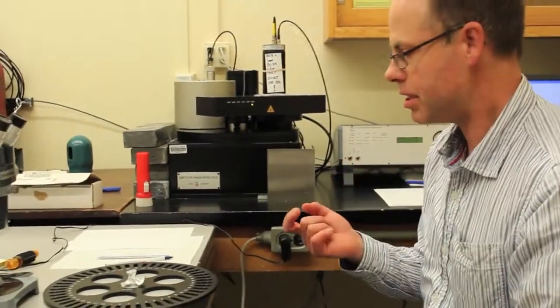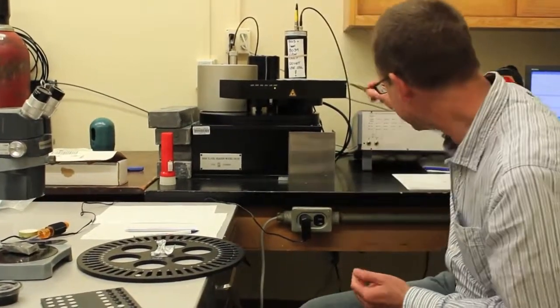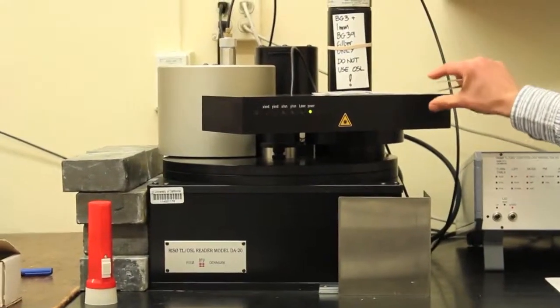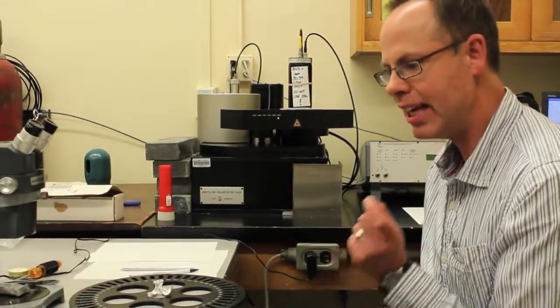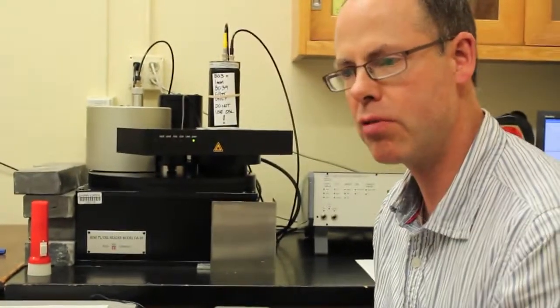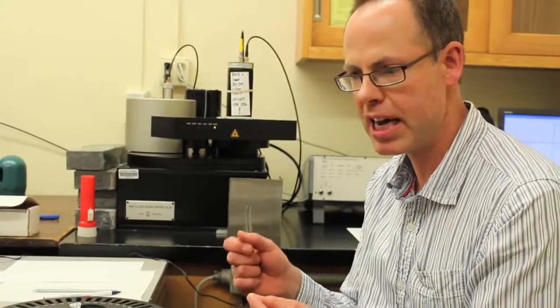And we can take this sample and then bombard it with light, and the light is in a series of light-emitting diodes mounted in this block on the right-hand side of the machinery. And we hold the sample at a slightly increased temperature, and that allows the electrons that became trapped over periods of hundreds of thousands of years within those quartz grains, since the quartz grain was last heated or exposed to daylight, the shining on of light in the machinery allows electrons to become untrapped.